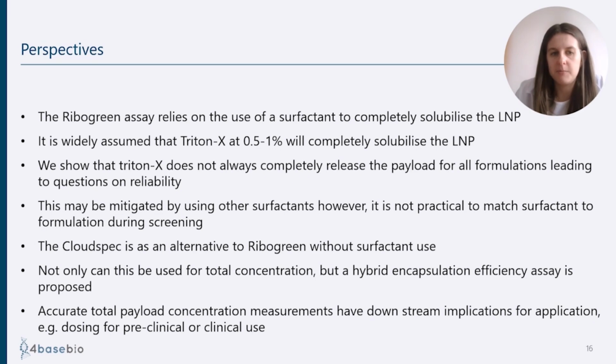But the CloudSpec, I think, presents an alternative to that RiboGreen without having to use any surfactant at all. You can use that for an accurate total payload concentration, but you can also use that in a hybrid encapsulation efficiency assay, where you just use the free payload. And having those accurate measurements is really important for downstream applications. For example, having a correct dose for your preclinical or clinical use.